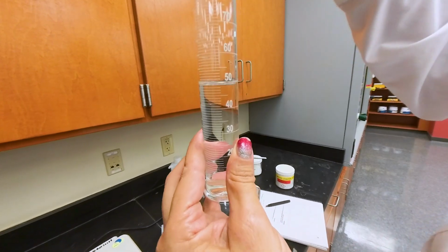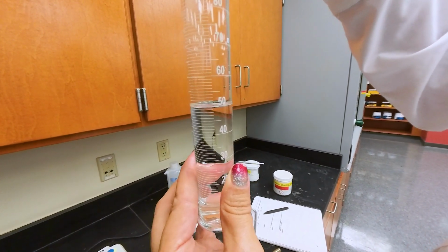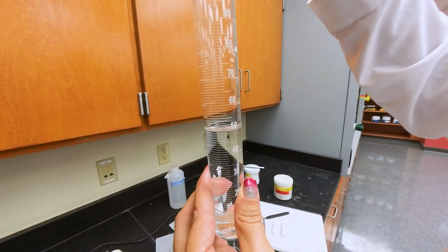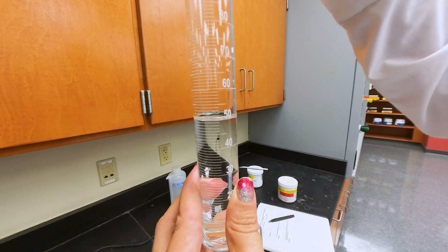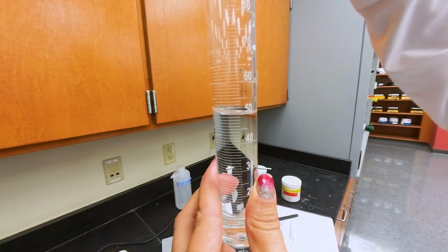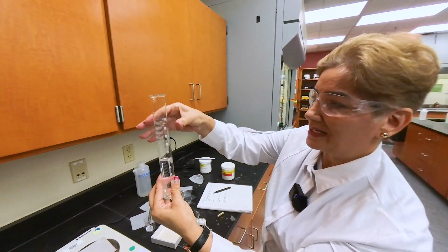So we are going to add to make it 50 milliliter. It's a graduate cylinder, so it's not as accurate as burette or pipette, but still we want to get it as close as possible to the 50 milliliter using the graduate cylinder. So I have 50 milliliter where the meniscus is at 50.